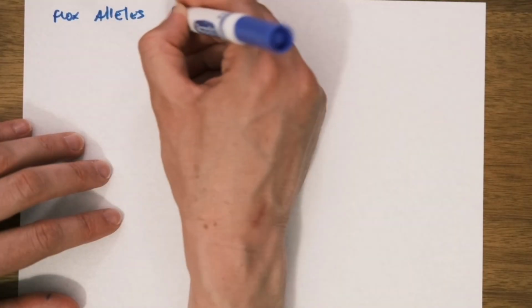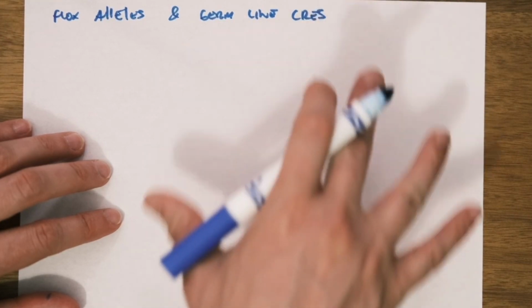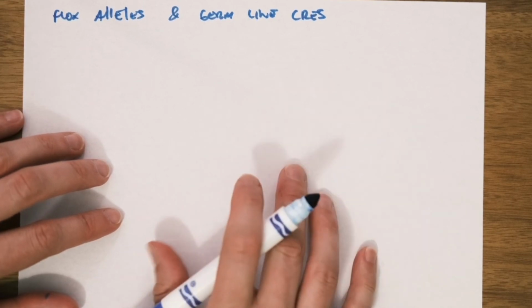Now, if we want to study early germ cell development using a Cre expressed in both sexes, we have some alternatives. Either we can use heterozygous animals or we can use an inducible Cre. Let me show what I mean with this. So let's cover now the example where we have Flox alleles and germline Cres that are expressed in both the male and the female germline simultaneously.